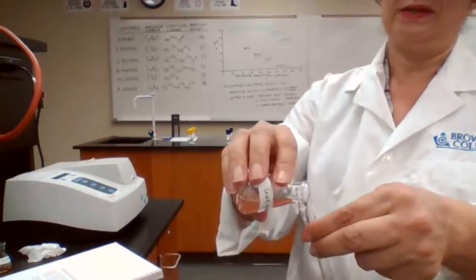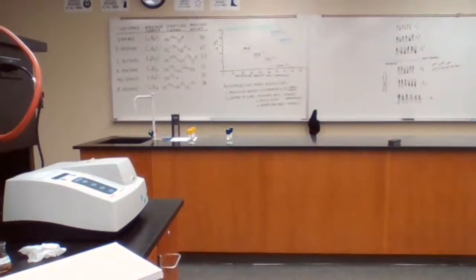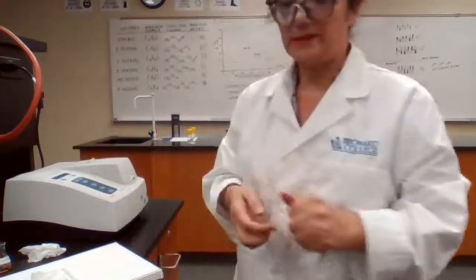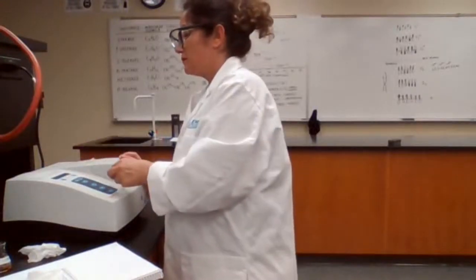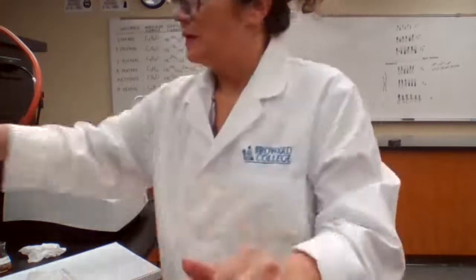So we're getting close to 2:18. Just going to fill up the test tube with the sample B and wait for the time. Okay, 2:18. 67.3%. Okay. Perfect.